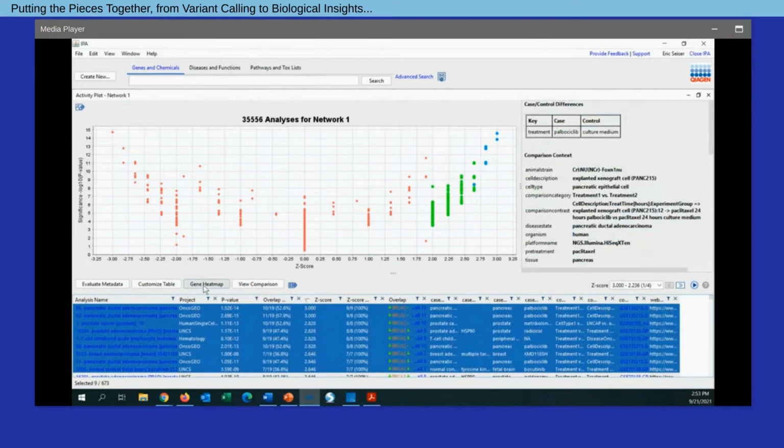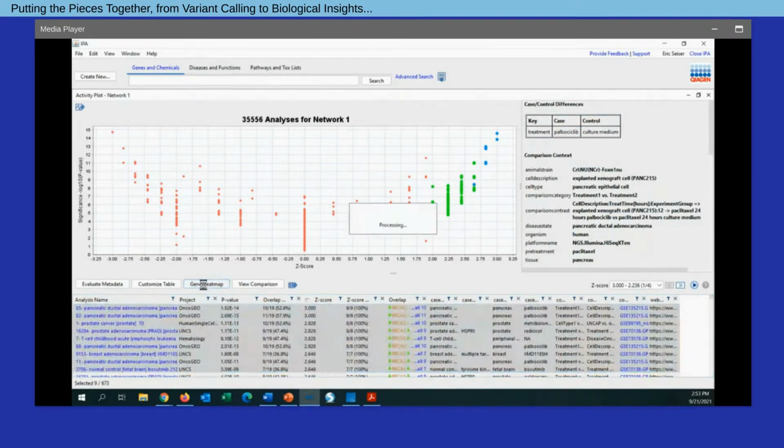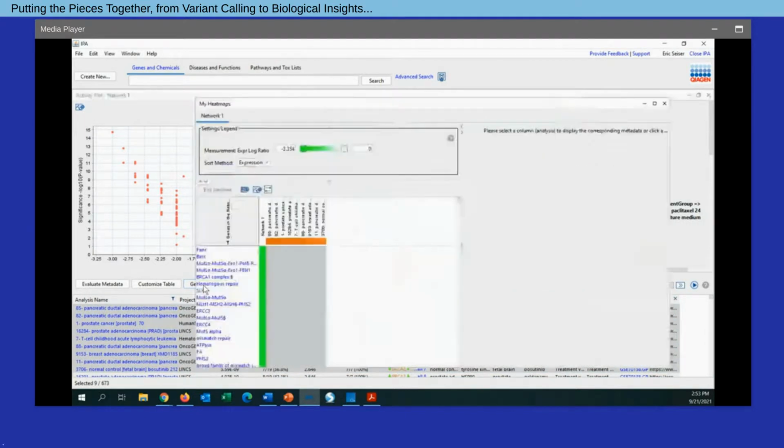And now open up this gene heat map to ask the question. We see conservation of this loss of function pattern in our data set with regards to gene expression in public studies. Now, what specific genes whose loss of function are identified in my data set in network 1 in the first column of this table actually show decreased expression in any of these studies?